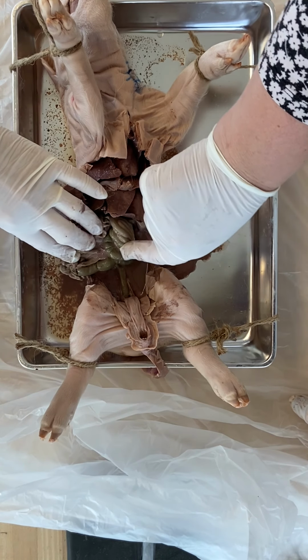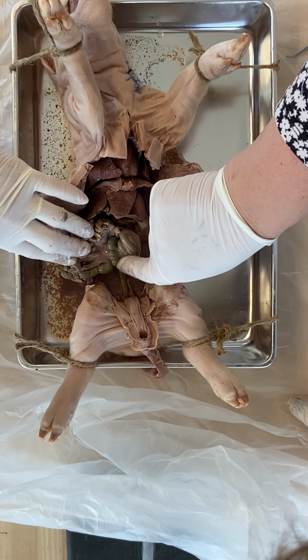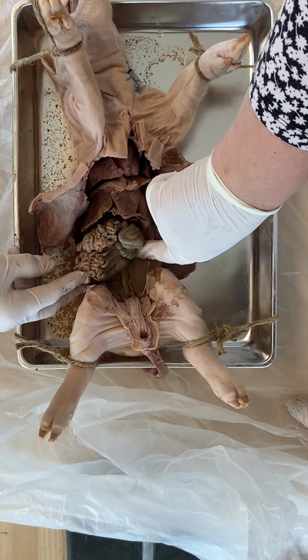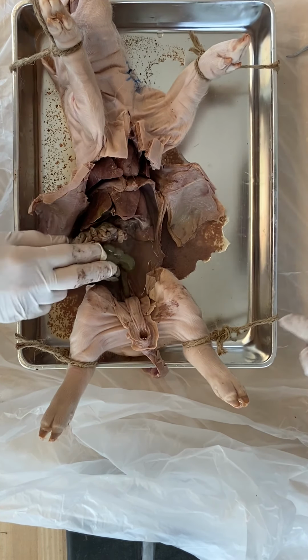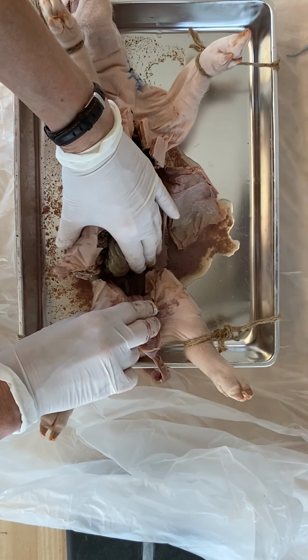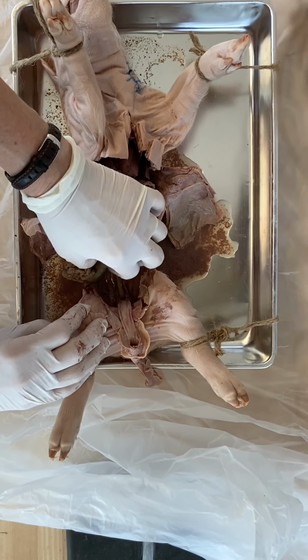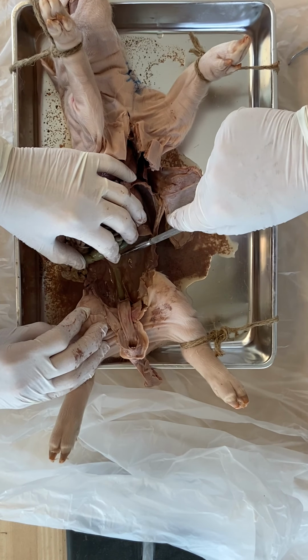Yeah. Okay. So the other thing you can see is the rings of muscle that go around. It gives the feces their form. So you can see the muscle that goes around and then feeds into the... Let's see if we can get this fluid out of him. Then it feeds into the rectum down here. So there you are. You can see the rectum going down here.